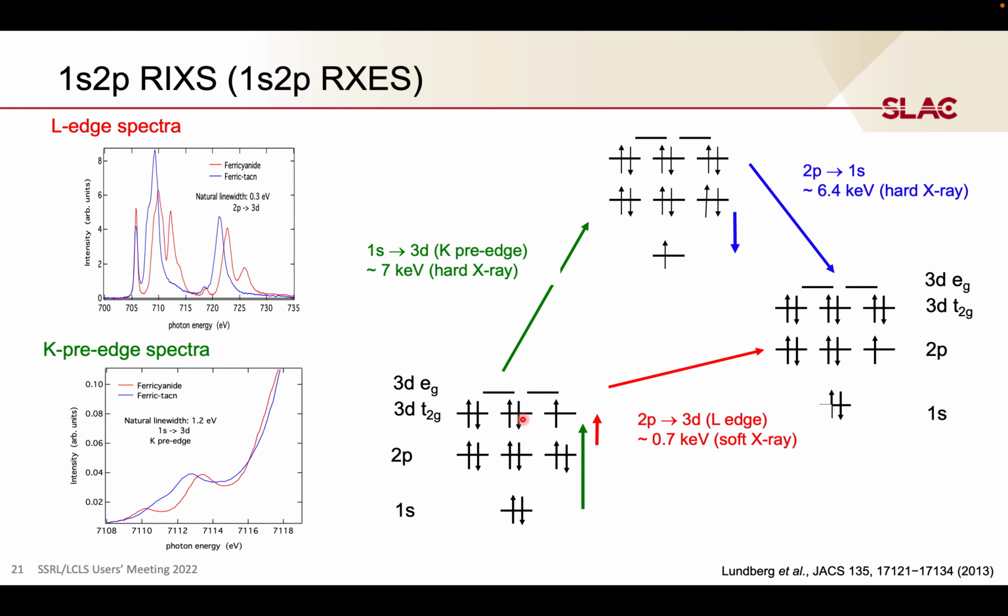So finally, as the last example in the presentation, we talk about RIXS, which gives a little twist to the absorption that you have mentioned before. Let's again use iron. We excite from the 1s into the 3d, which means we do a K-edge absorption, and we end up at an intermediate state like this. It's a configuration similar to this one. And now the 1s hole will be filled with the 2p, leaving a final state configuration. It looks like this here.